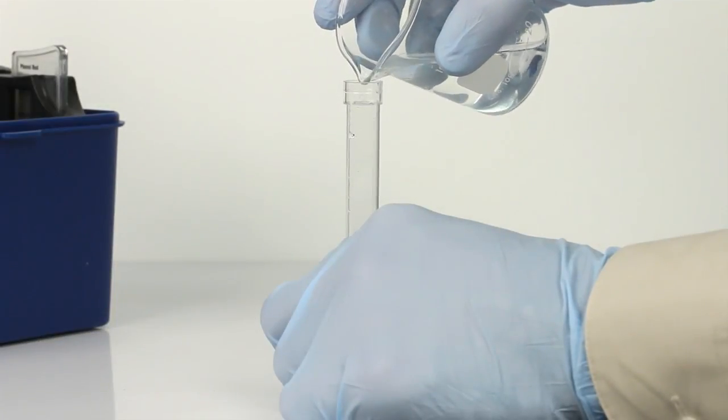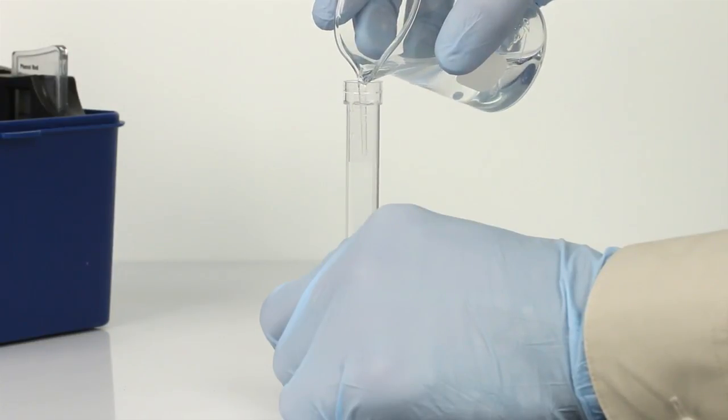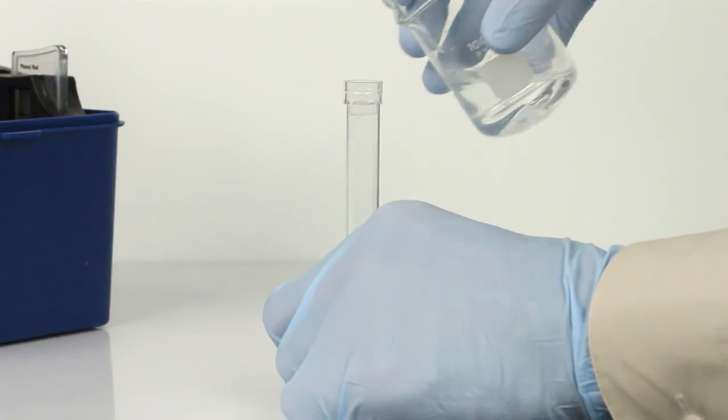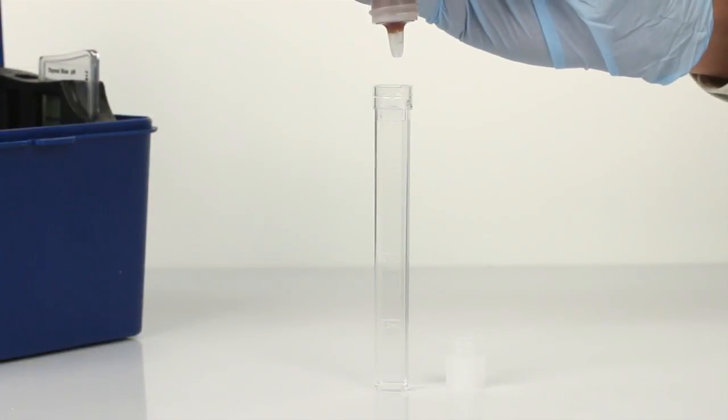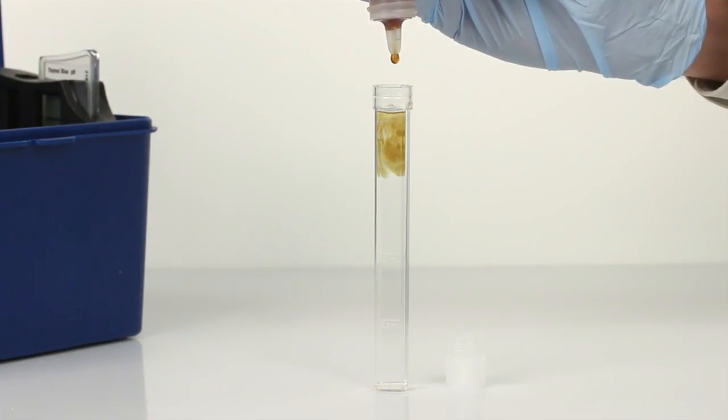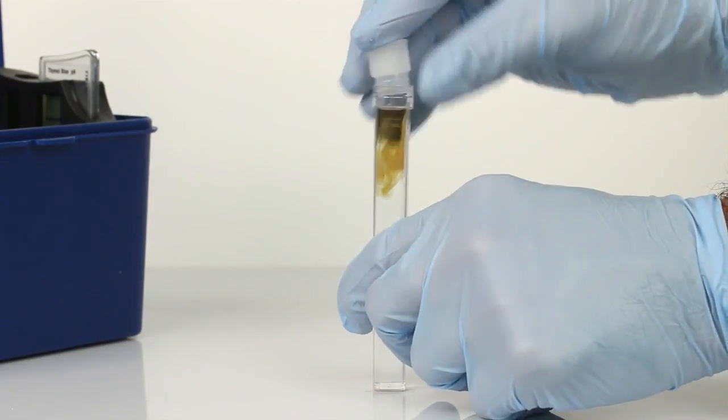Once you have rinsed the vial three times, fill to the 10 ml line with your sample. Next, add 10 drops of Thymol Blue indicator. Cap and mix.